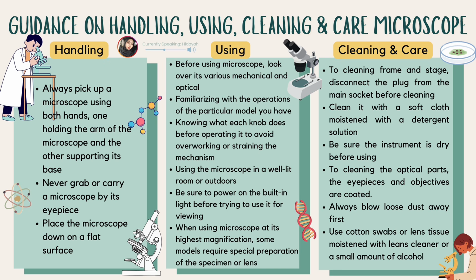Know what each knob does before operating it to avoid overworking or straining the mechanism. Use the microscope in a well-lit room or outdoors, and be sure to power on the built-in light before trying to use it for viewing. When using the microscope at its highest magnification, some models may require special preparation of the specimen or lens.